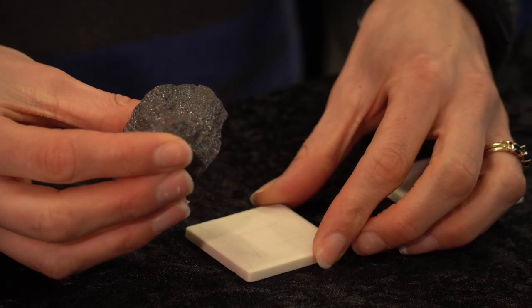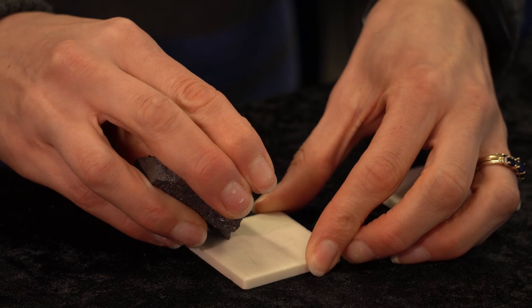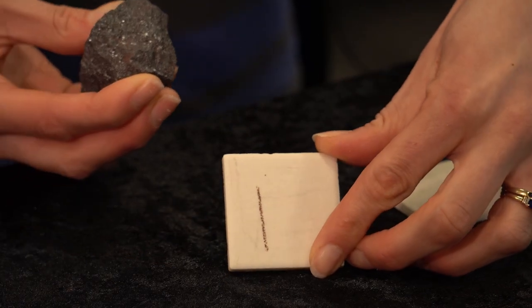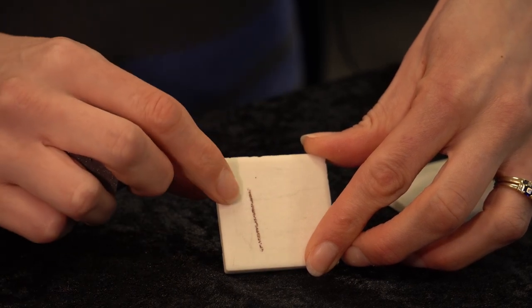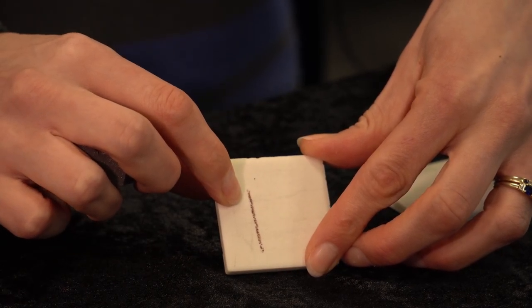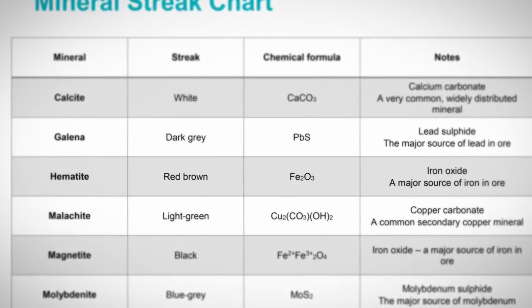Hold the streak plate firmly on the table and push the specimen across the streak plate, leaving behind the powdered mineral. You can see that this specimen has left a red-brown streak. I'll then look at my mineral streak identification chart and see that a red-brown streak suggests that this sample is haematite.